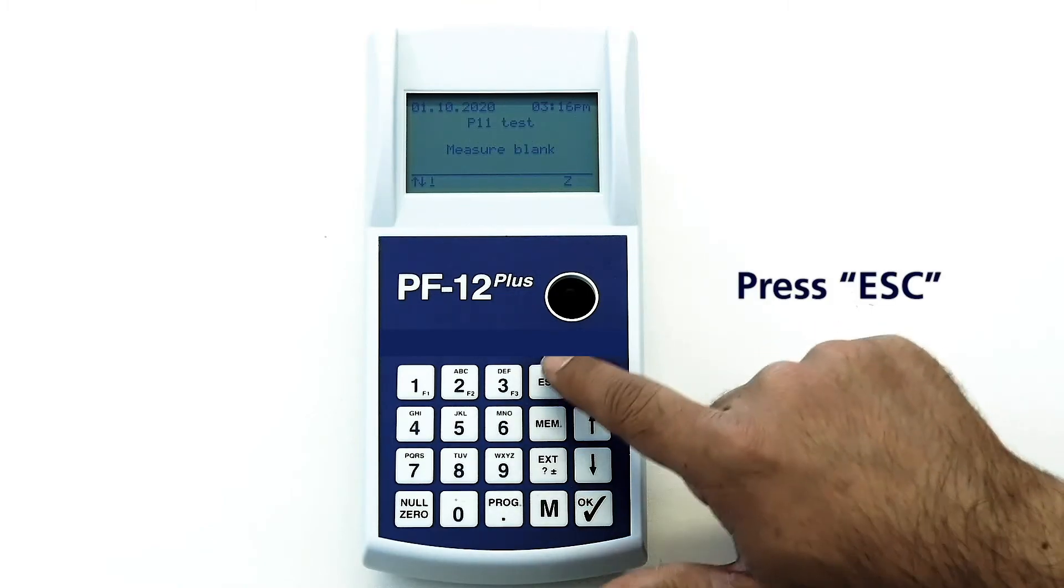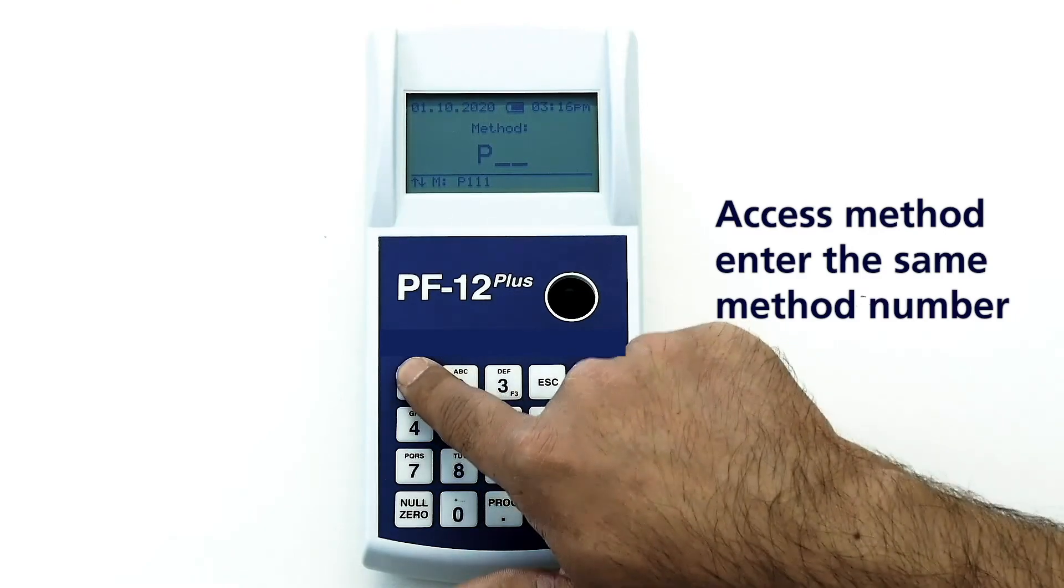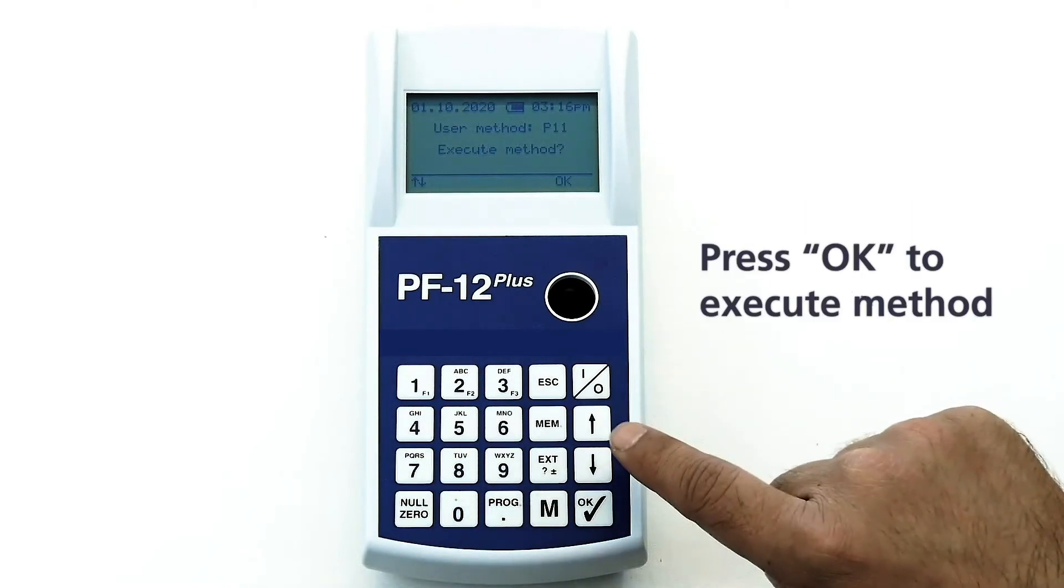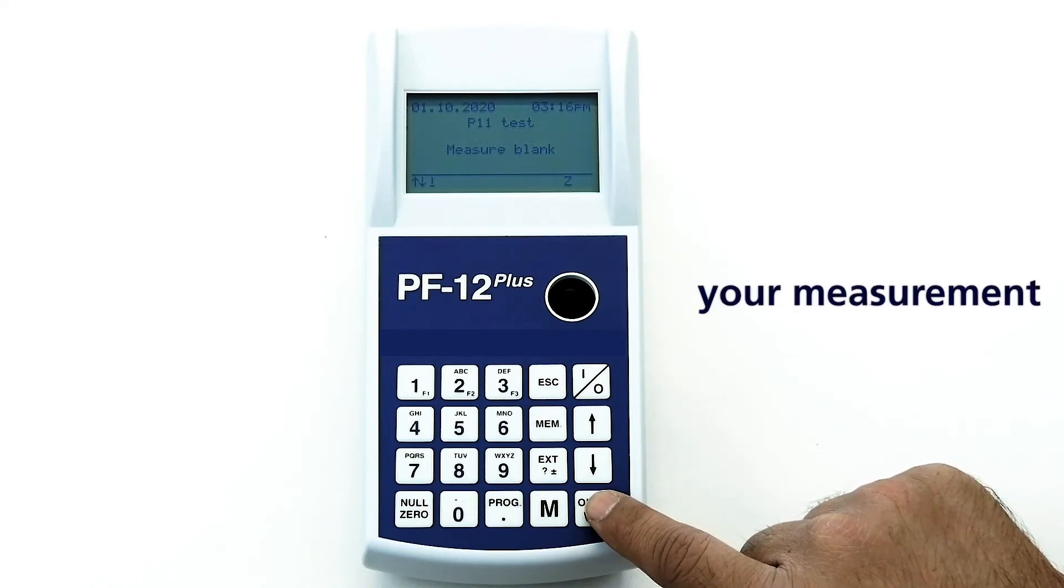Press escape. To accept method enter the same number. Press OK to execute method. Now you can start your measurement. That is all.